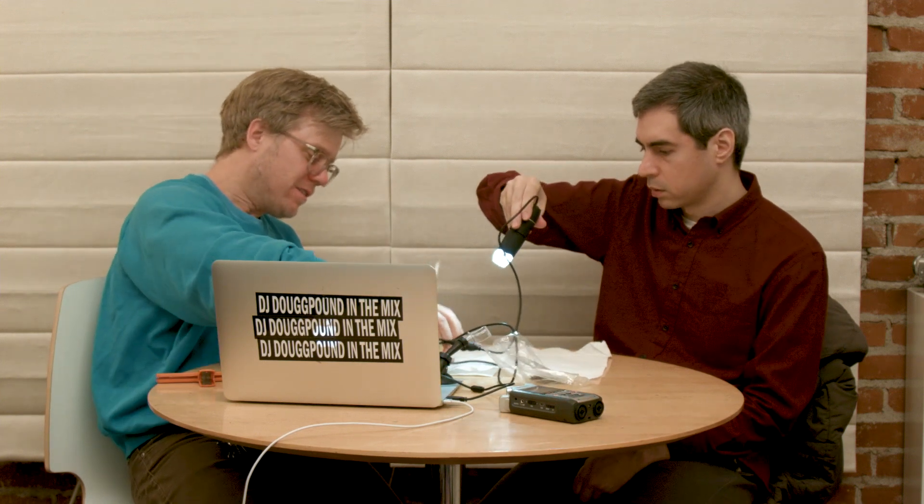Cook it up. Let's get things cooking. This I bought already cooked — coconut rice. It's brown rice. Brown coconut rice. It comes cooked — you just heat it up. What a convenient thing for those of you who don't really want to cook. Let's do one grain. You do have to heat it up.